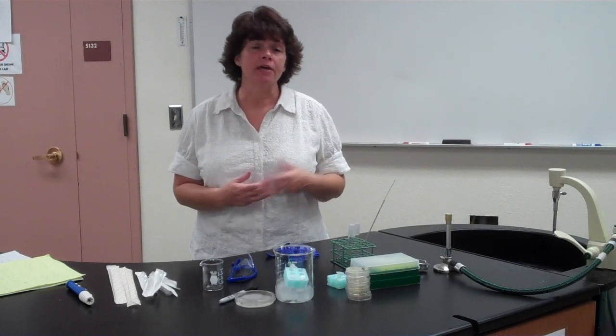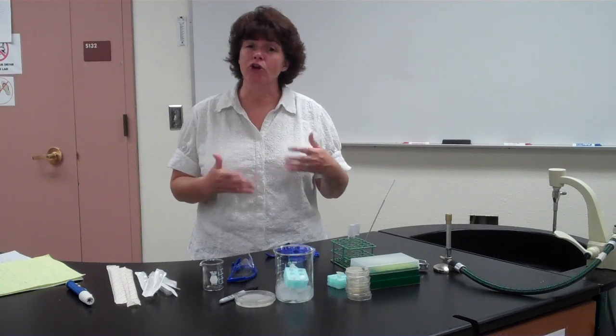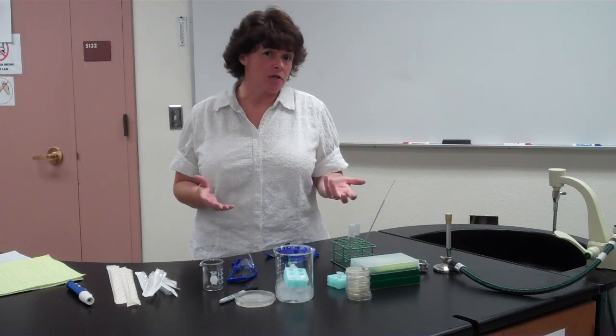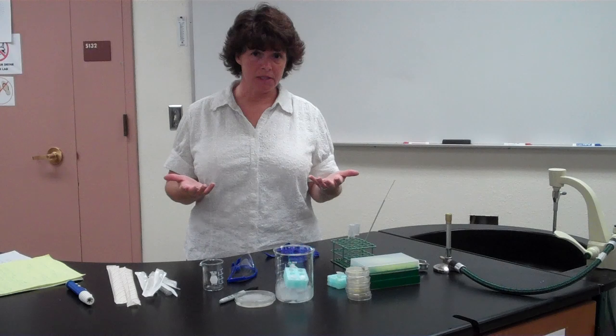So what we're going to be doing is we're going to be taking E. coli. E. coli in itself is non-pathogenic. It's something that lives in your gut. There are strains of it that are pathogenic, but normal E. coli is not. Normal E. coli is also not resistant to antibiotics. So as part of our transformation, we're going to be giving it some special abilities.